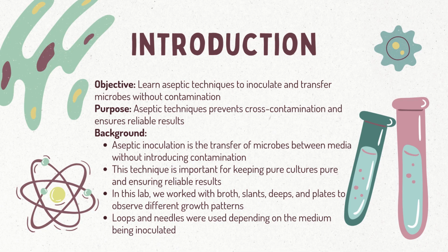The main objective of this lab was to learn and practice aseptic inoculation techniques, which means transferring microorganisms from one medium to another without contamination. This is one of the most important skills in microbiology because it allows us to keep pure cultures pure and ensures that our results are reliable.